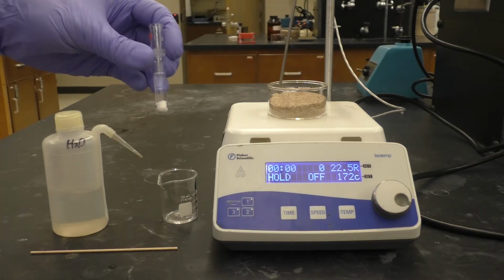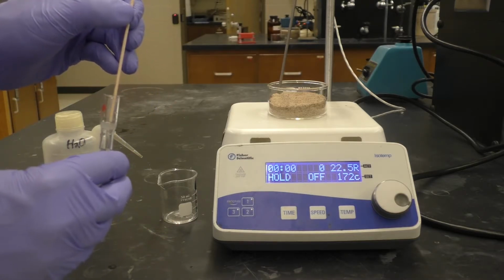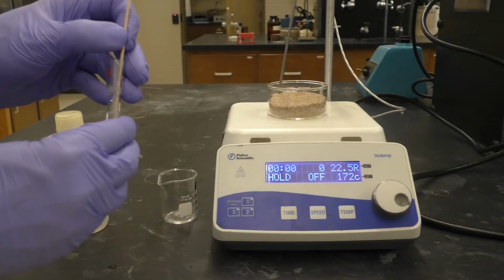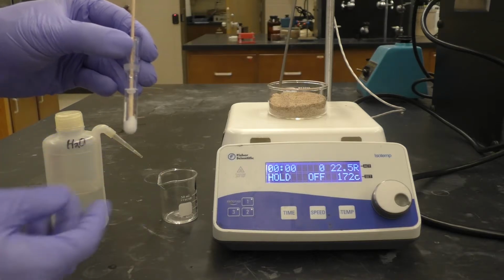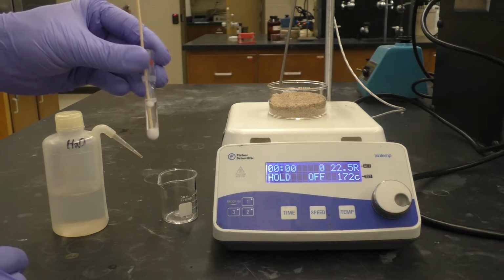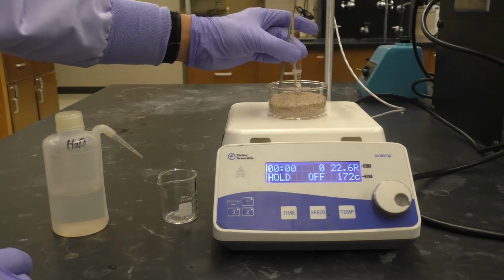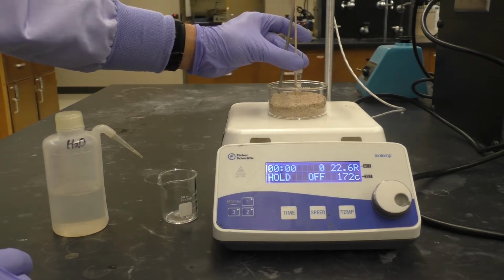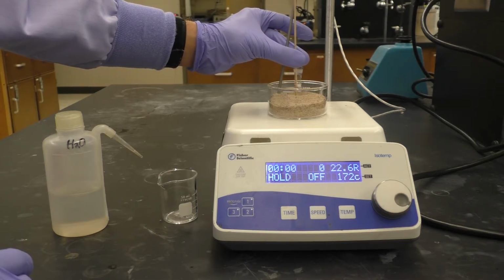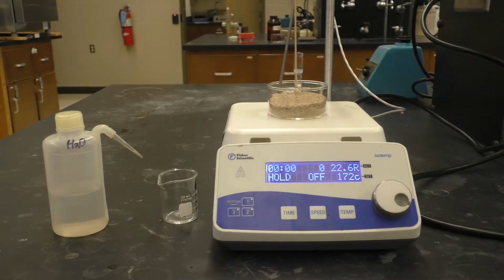I've got my water. I will then want to add a boiling stick to this just to prevent it from bumping. We talked about that briefly with the distillation lab. We don't want to get bumping here, and so this will hopefully help once the material starts boiling. Then I'll simply bury the Craig tube into the sand bath on the hot plate. I could clamp it, but it seems to be fairly stable just as it is. And then I want to set the hot plate a little bit above the boiling point of water.